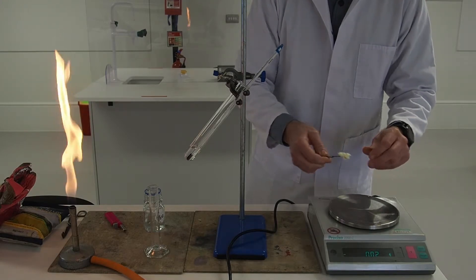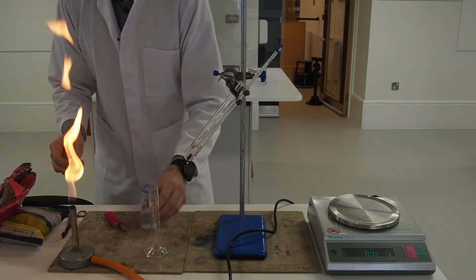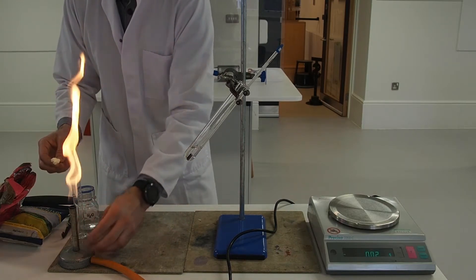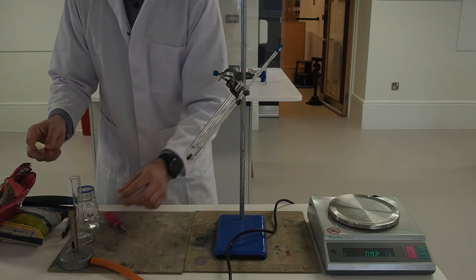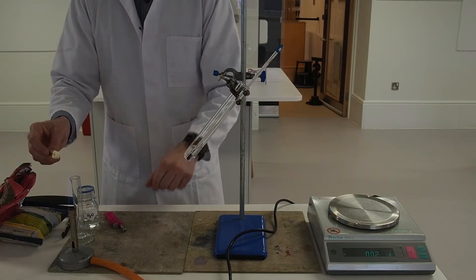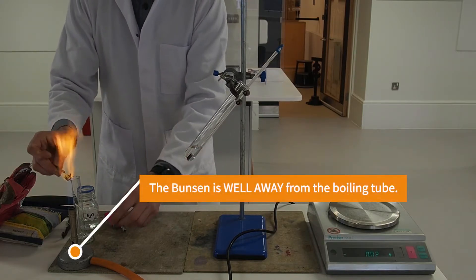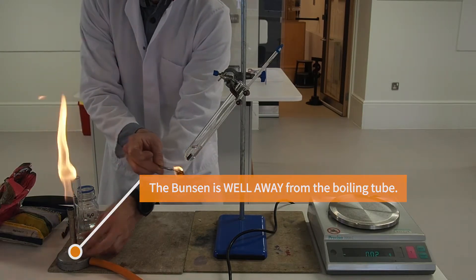We set fire to the food at a distance far enough away from the boiling tube so that the Bunsen burner isn't actually influencing the temperature of the water that we're going to measure. Once the food is lit it's transferred quickly underneath the boiling tube.